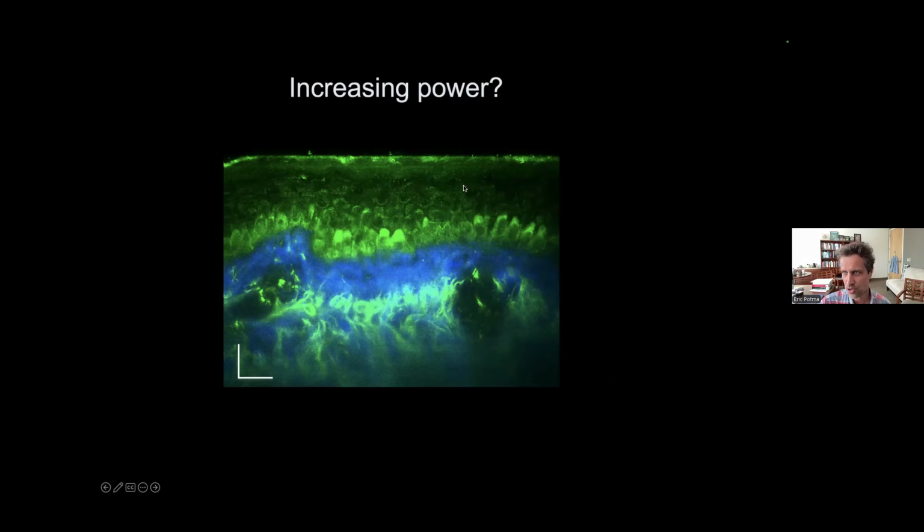If you go to different parts of your body, then this epidermal layer can be significantly thicker, all right? And so you will not be able to reach the junction. And in many cases, you would like to really get into the dermal layer because that's where many pathologies actually originate, okay? And so it is really important to be able to move beyond a few hundred microns, okay? So this image, as beautiful as it is, is kind of an exceptional case.